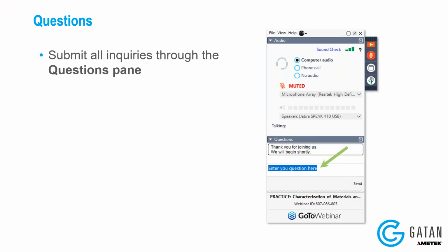Yeah, so essentially my workflow for setting up diffraction on the Metro or the K3 or Alpine cameras, any of Gatan's direct detection cameras, is to first put in the selected area aperture on the microscope, and then change the magnification so that that selected area aperture is entirely within the field of view of the camera, and then adjust the intensity of the beam until I have a good number of electrons hitting the camera.